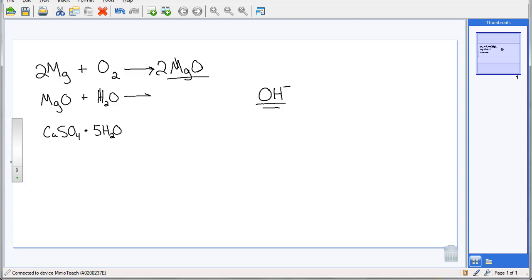Now, this is decomposing, and this is the part that some people struggle with, is they look at this and they think, oh, well, there's really 2 things here. This is all part of the same crystal. This is that bright blue crystal that I gave you in the test tube. And I asked you to heat it up. Okay, and as it heated up, then the crystal went from blue to white. Then we waited a little bit, we waited for it to cool, and it went back from white to blue when we added a few drops of water.